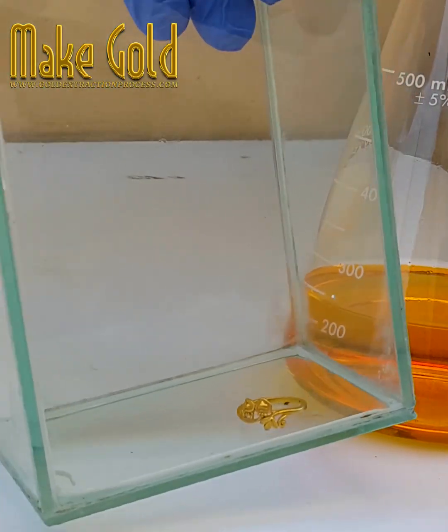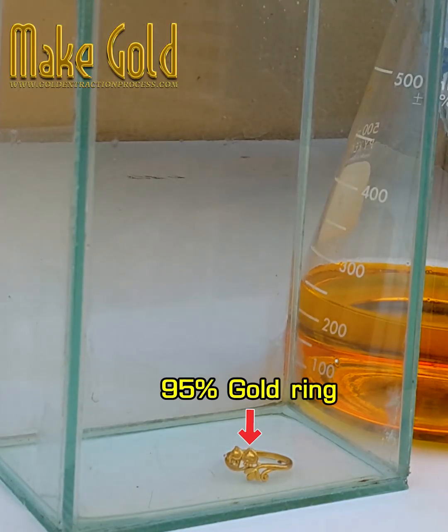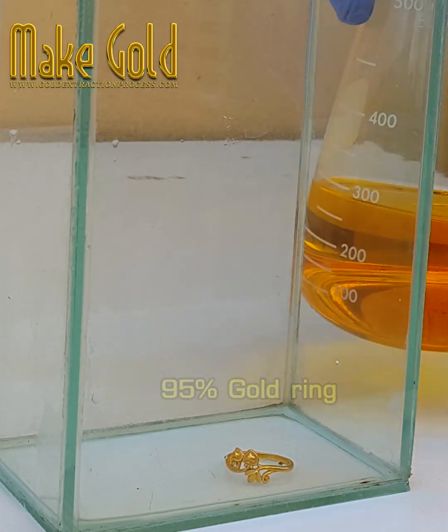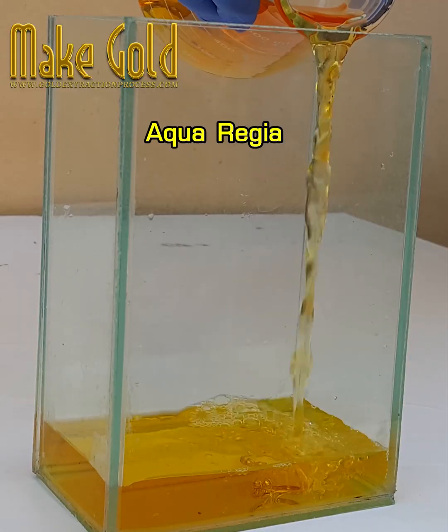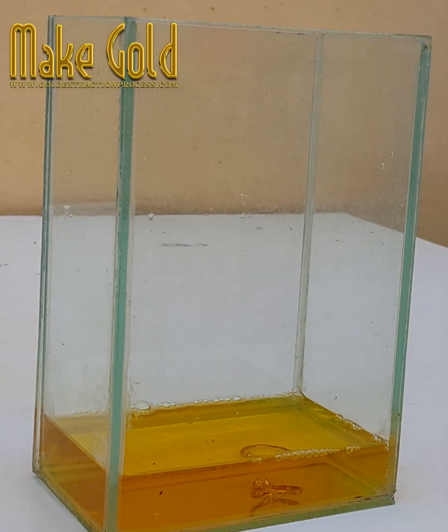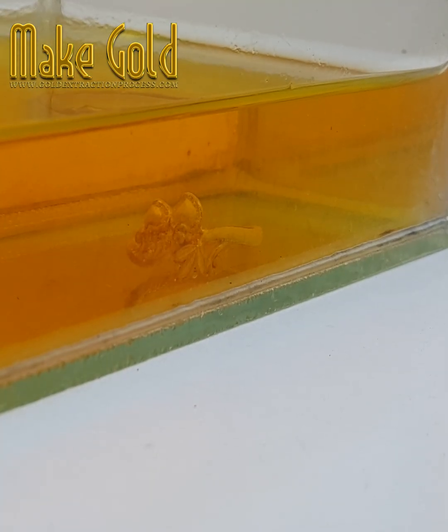In some cases, if gold is mixed evenly in the alloy and at a low enough concentration, you can use plain nitric acid to dissolve away impurities. However, if the gold is more pure or is an external plating, what actually happens is that the nitric acid tries to dissolve everything but the gold blocks it from coming through.